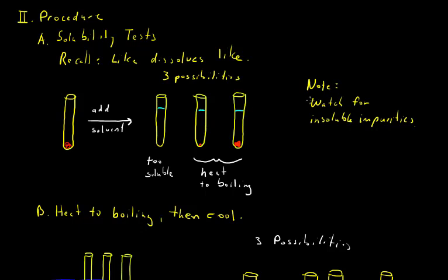In these two situations, the next thing you're going to want to do, and actually before I mention that, I should note here that you want to watch for insoluble impurities. The compounds that you're going to be recrystallizing in the laboratory, the unknowns, will have impurities in many cases added to them. Those impurities will tend to be insoluble and won't dissolve at all. So if you see solid, it doesn't necessarily mean that your compound's not dissolving. The impurities that you'll be seeing in the laboratory will be colored. That is, they'll be dark, they'll have color to them, they might be black. In all cases, the unknowns are the same color as most small organic molecules, and that is colorless. So keep a close eye on this. Just because there's solid down here doesn't mean that your compound isn't dissolving. So watch out for impurities.